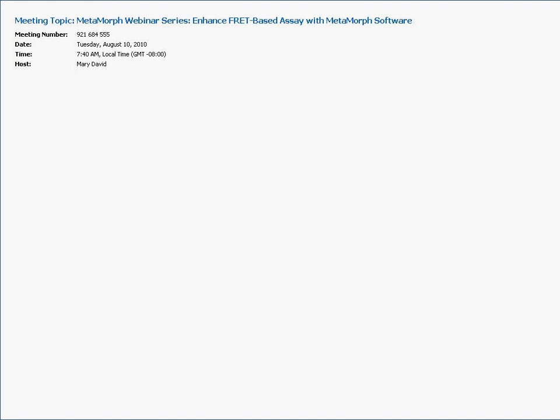I should have done background subtraction on this and divided it by this image. This also explains why I matched the uncorrected versus the not background subtracted initially. So my FRET efficiencies were probably a little low here, because the background here is a lot higher than it is here, and so that division is going to be a little bit larger.